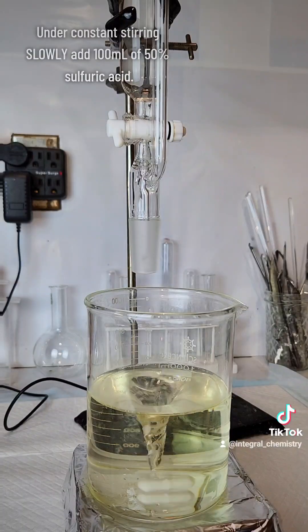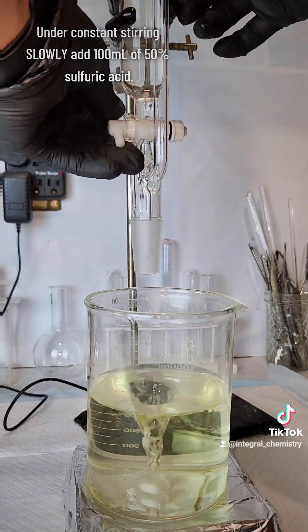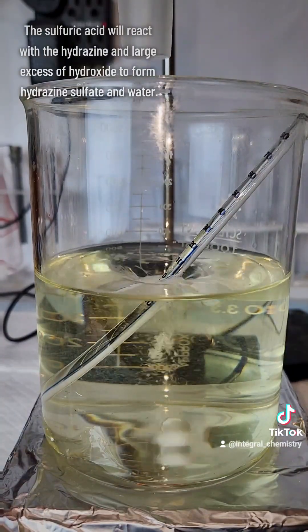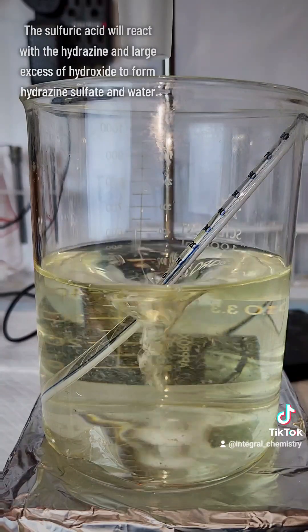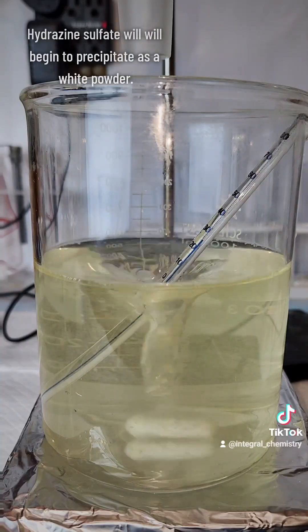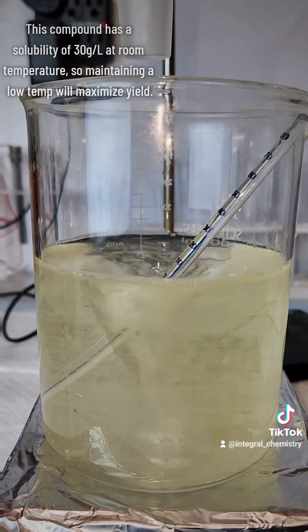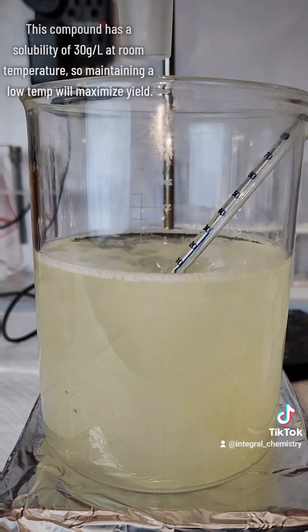I maintain 85 degrees Celsius for 5 minutes, take it off the hot plate, put it in the freezer, and chill to 0 degrees Celsius. I then very slowly and under constant stirring add to it a 50% sulfuric acid solution that's also been chilled to 0 degrees Celsius. The sulfuric acid will react with the hydrazine and sodium hydroxide to form hydrazine sulfate and sodium sulfate. Hydrazine sulfate has a solubility in water of about 30 grams per liter at room temperature, so keeping this as cold as possible is important to maximize my yield.